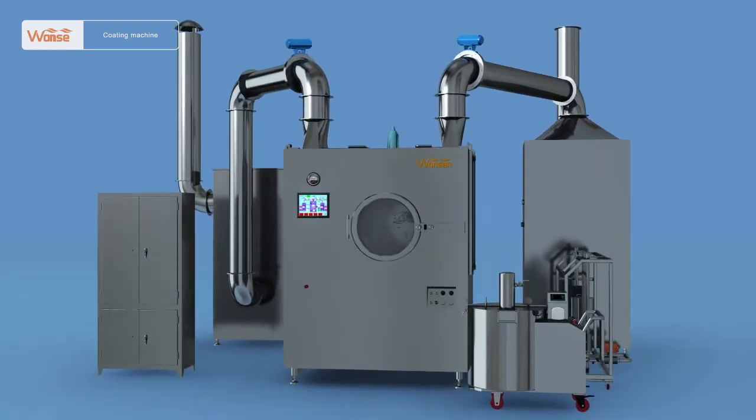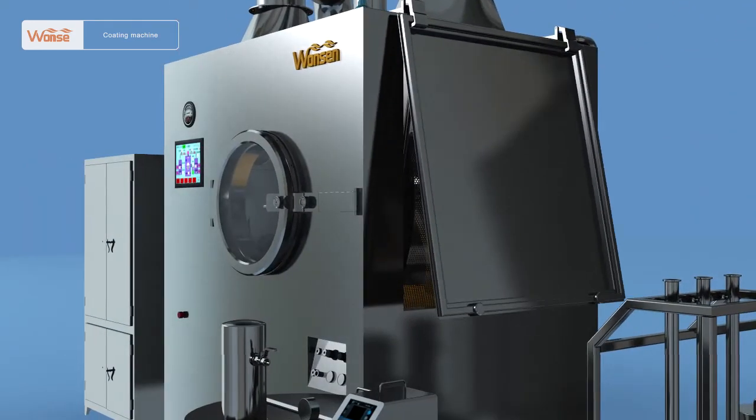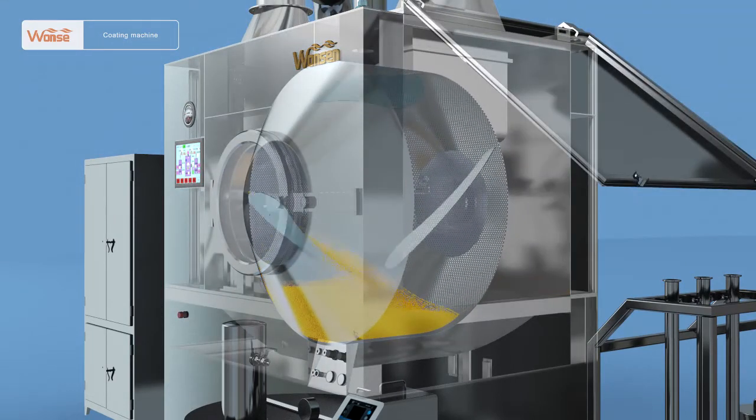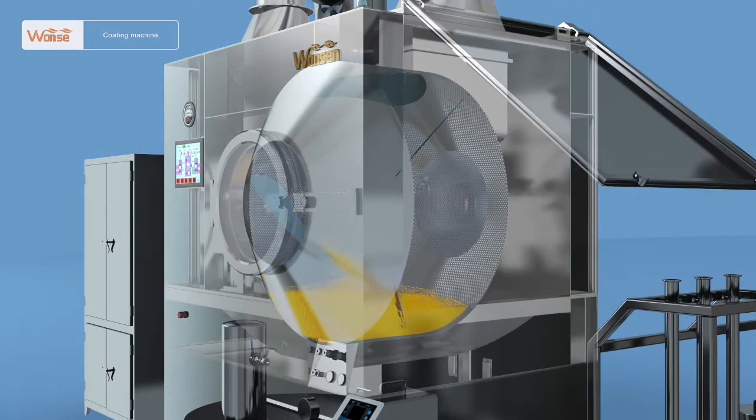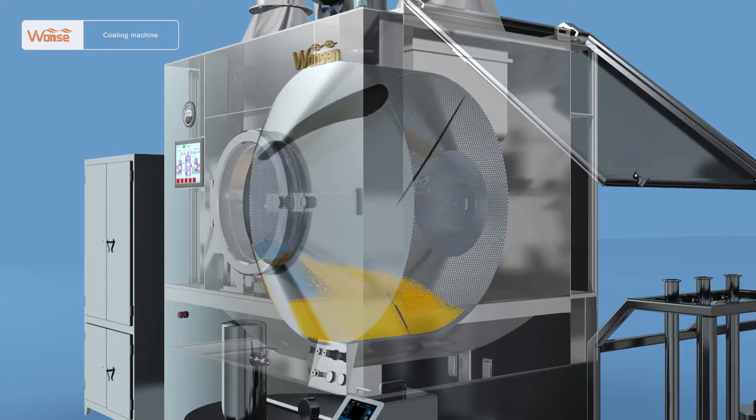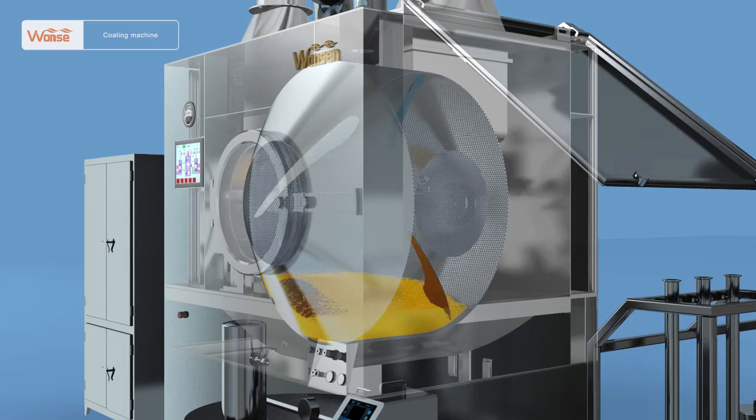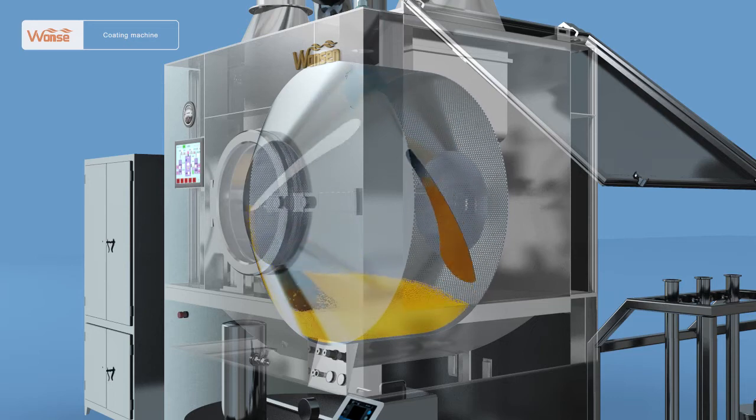All coating operations are carried out under a closed negative pressure status without dust and splash of sprays. It is a new type of coating equipment with high quality, high efficiency, good cleanliness, energy conservation, and convenient operation.